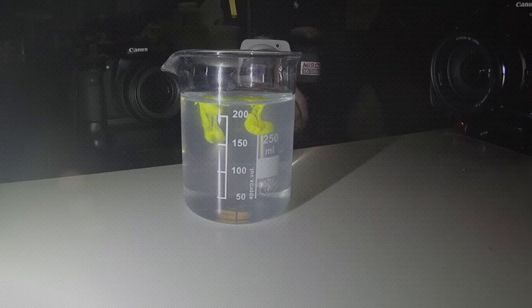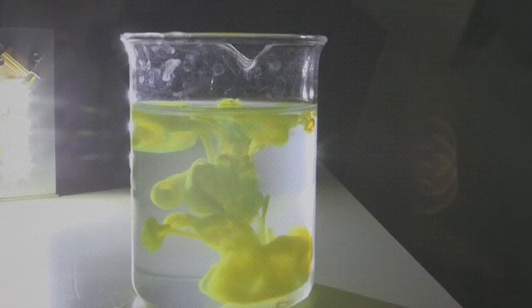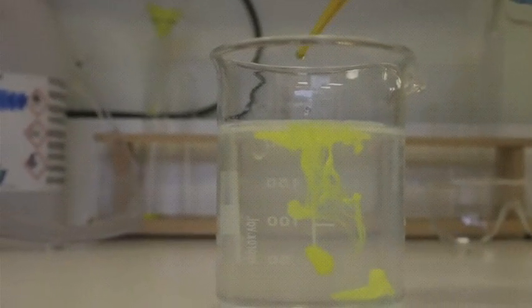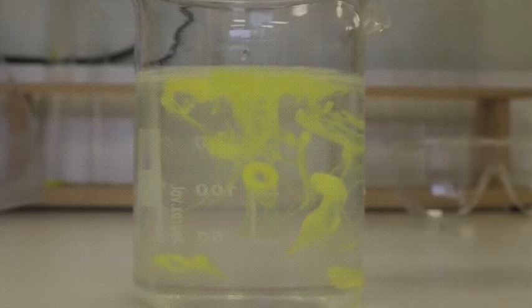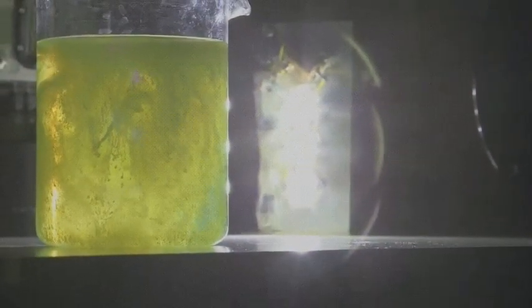It used to be called chrome yellow and be used as a paint. Now people don't really want to use lead salts in paints, but you can still see this terrific colour. It's important to say that even for chemists like me, to see this reaction yet again is really exciting, particularly because the formation in the beaker is governed by the swirling of the liquid and the mixing, and you see really beautiful patterns, and it always gives me a thrill.